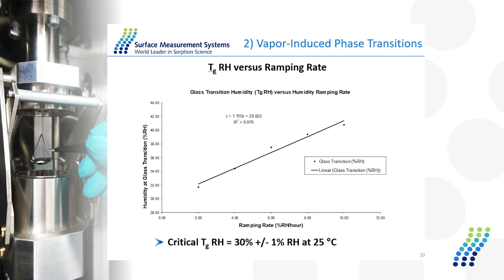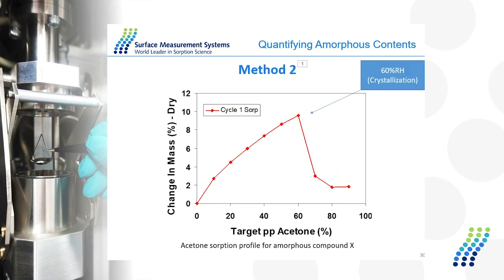Acetone, for example. Yeah, that's something we need to do during the method establishment step. Like, we need to find the right solvent, induce this phase change at different temperatures as well.